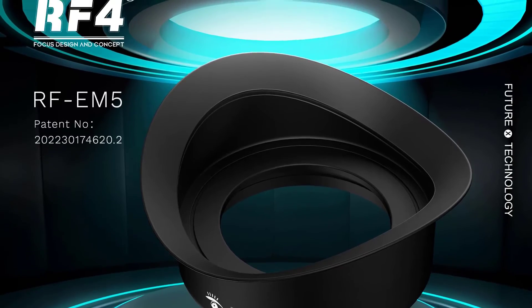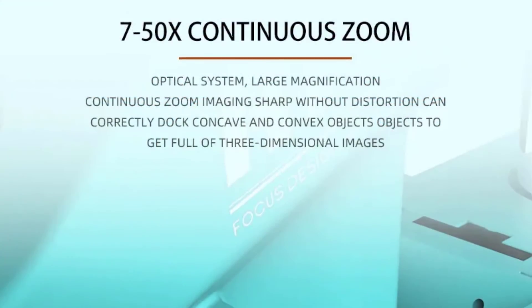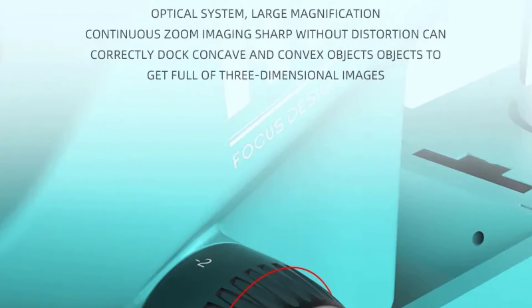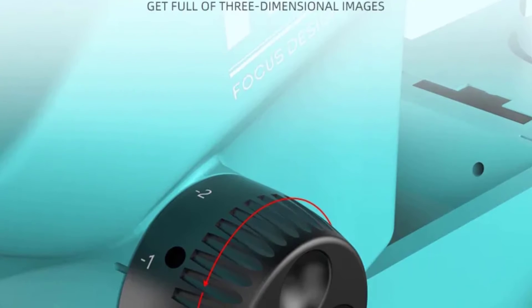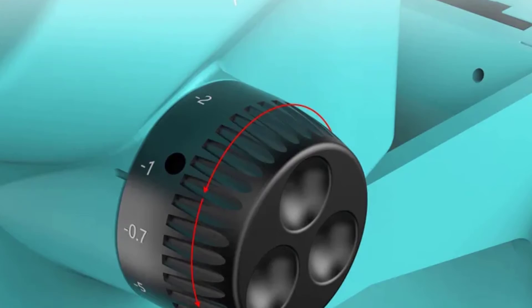The microscope's metal construction adds to its durability, ensuring that it will last for a long time. While the build quality is excellent overall, I found the microscope to be a bit heavy, which might be a minor inconvenience if you need to move it frequently. However, this weight also adds to its stability when in use.